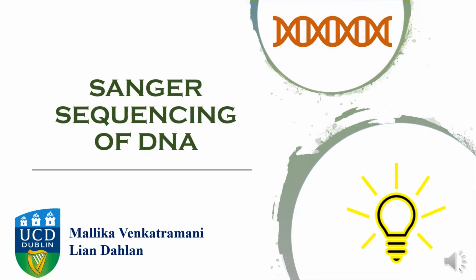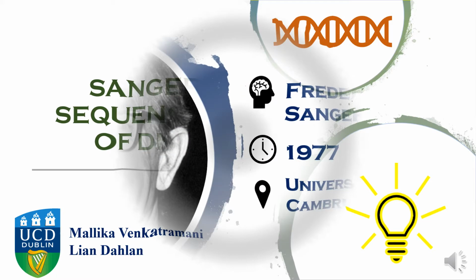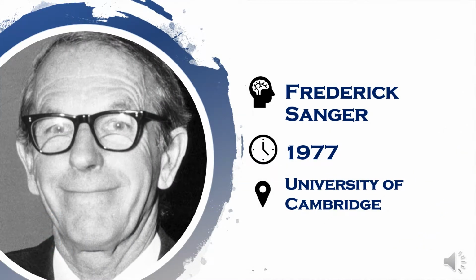The Sanger sequencing method is one of the most widely used methods for sequencing DNA. It was developed by Frederick Sanger in 1977 at the University of Cambridge. This process largely relies on the principles of DNA replication.